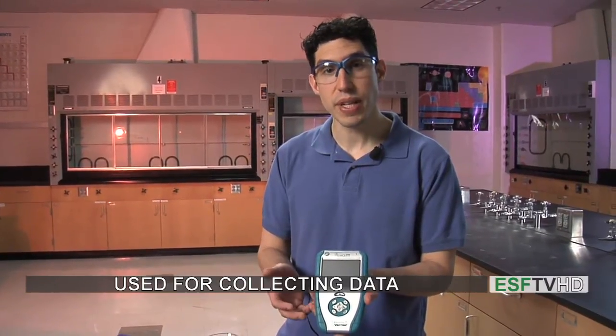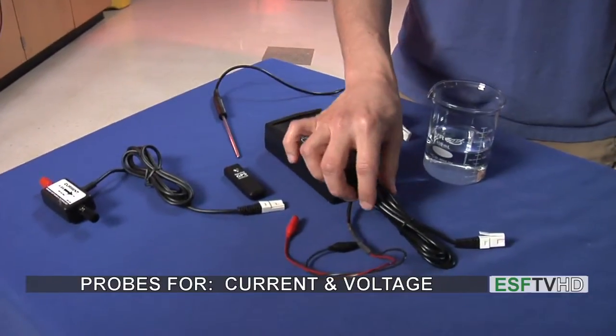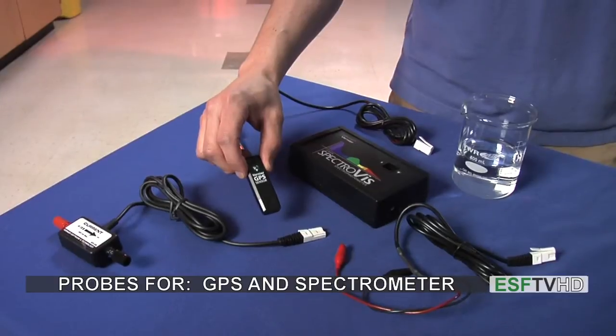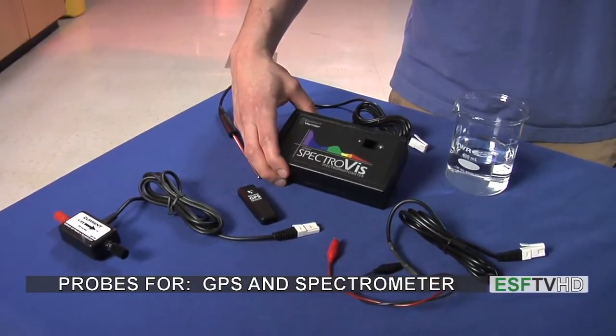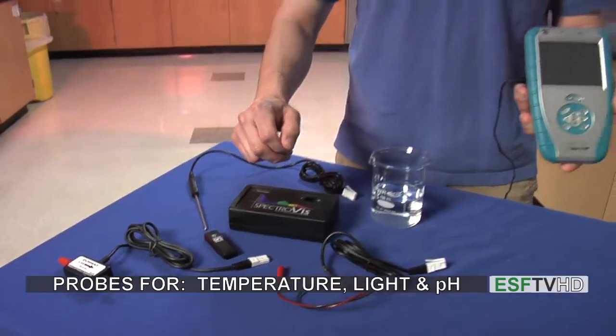The different probes we can connect we see over here. We have a current probe and a voltage probe so we can measure voltage. We even have a GPS sensor so we can connect this and get GPS coordinates. We have a spectrometer and we have a temperature probe. All of these different probes connect to the LabQuest so we can make a measurement.